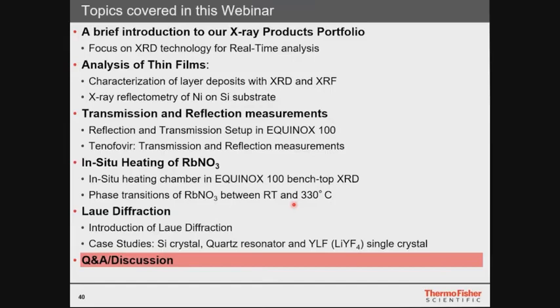It depends on the sample and on how you crush it. For example, if you use an agate mortar, and if you are very careful, you can usually crush any sample. Now, some samples are very sensitive to heat or pressure, and you will change them.